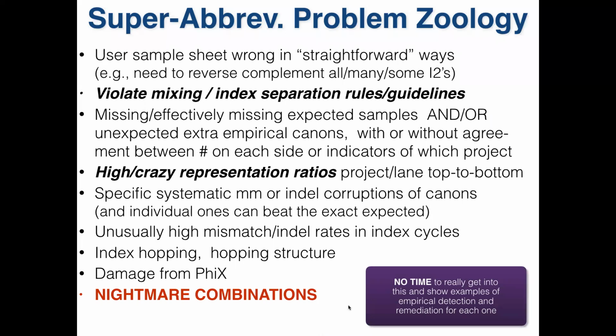Just be careful when you're making your sample sheet, actually reading the text, knowing the platform you're on, and actually putting in the right sequences. Sort of simple, but that happens a surprising number of times.